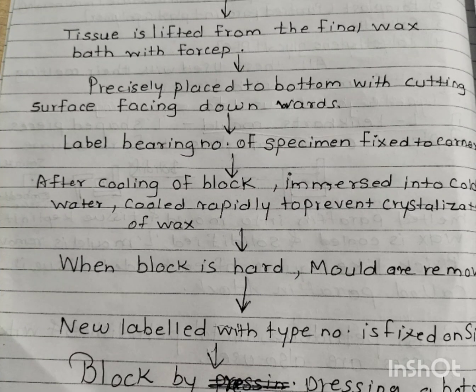So the first technique starts with the placing of the mold. The mold is placed on a tray or a metal piece. So it must have a base, which may be a tray or a metal piece, or maybe a glass plate. Anyone will do. Then fresh molten wax is poured into the mold.